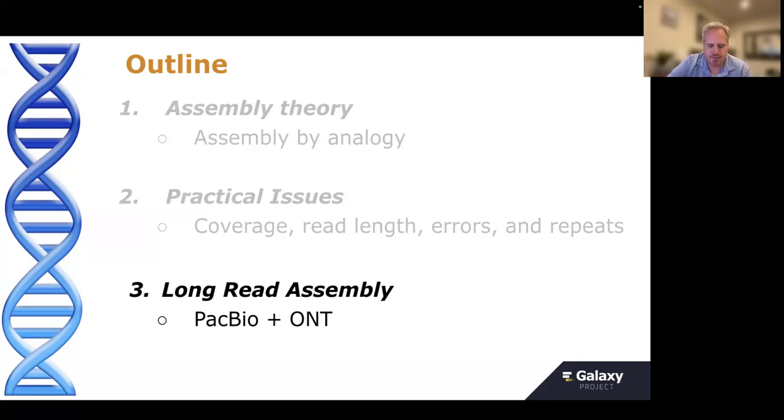Now, many genomes have been sequenced with, say, Illumina sequencing, and yes, you can do de novo assembly of them. There are good tools like SPAdes, which would be my recommendation today. There are good tools available for short read assembly, but because the reads are short, inevitably the assembly will be relatively poor. SPAdes is an excellent assembler given the data that's available, but because mammalian or vertebrate genomes have so many repeats and so much heterozygosity, with short reads your contigs tend to only be a few thousand to tens of thousands of bases long, compared to the lengths of the chromosomes, which are tens of millions or hundreds of millions of bases long.